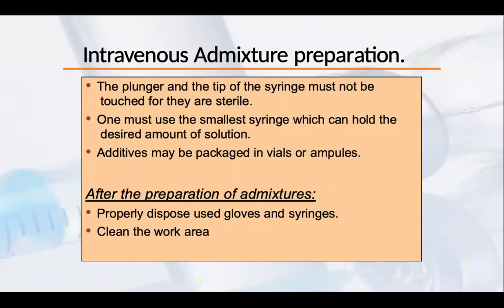After preparing the admixture, properly dispose of used gloves and syringes. These things have to be thrown out; they cannot be reused. So clean the work area. After completion, they dispose of the gloves and whatever disposable syringes they have used, and then clean the work area.